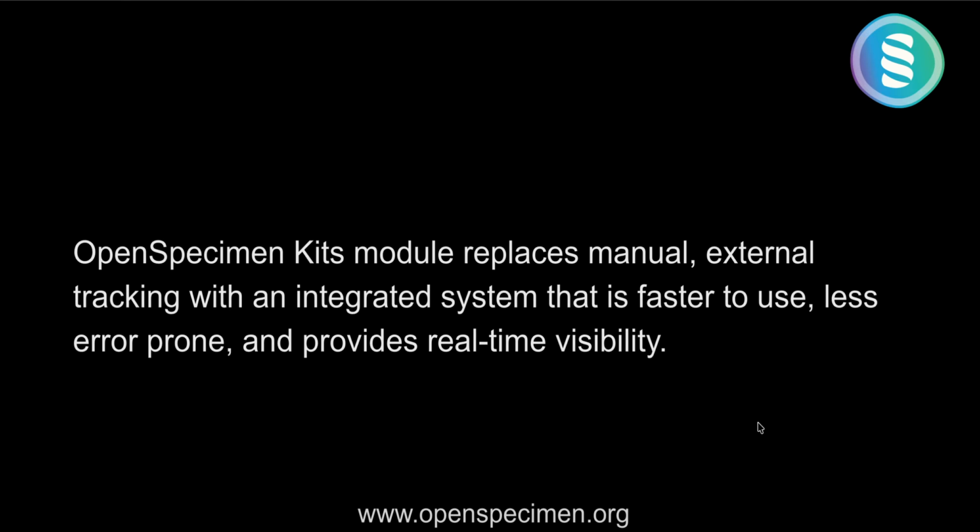Third, it allows the tracking of the kit shipment from the collection to the supply site or the supply site to the collection site. And lastly, the validation ensures that the specimens collected match the expected kit configuration.